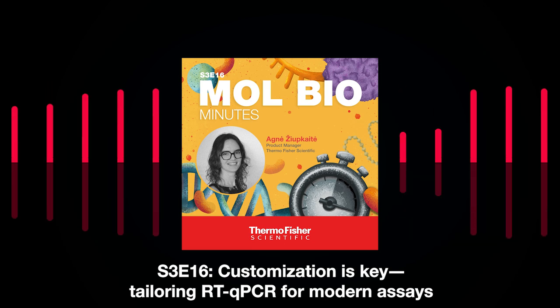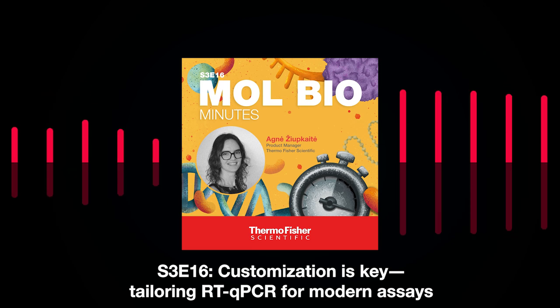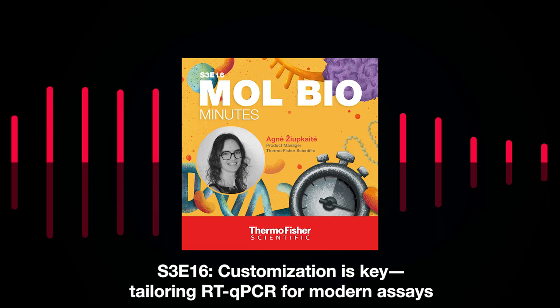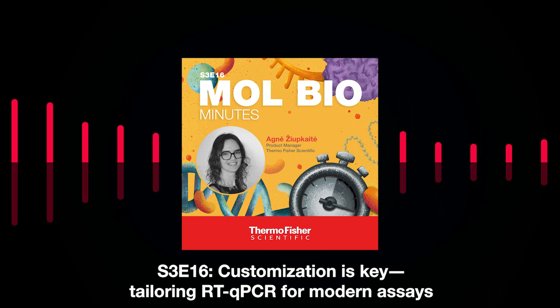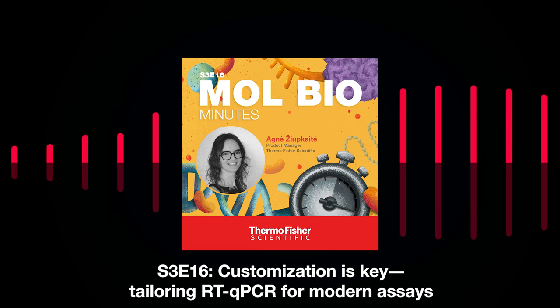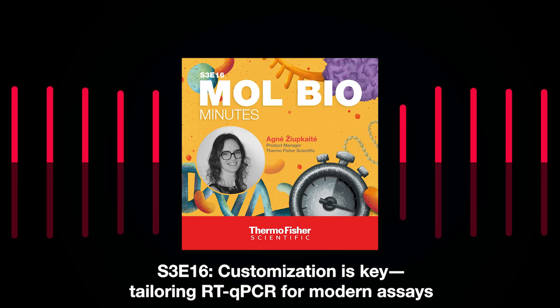Hello, everyone, and welcome back. Let's talk today about one-step RT-qPCR assay, focusing on the reverse transcription step and customization capabilities. When you start thinking about research for molecular methods like pathogen detection, virus surveillance, gene expression analysis, or any other molecular method, what challenges come to your mind first?